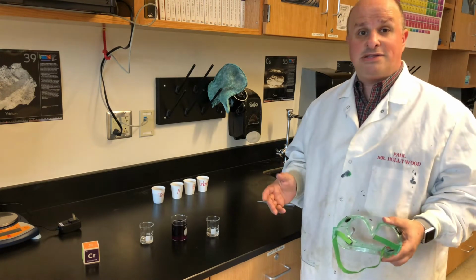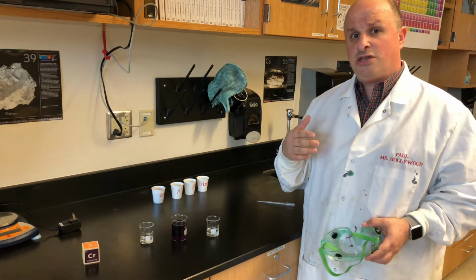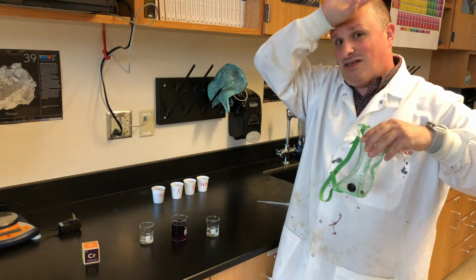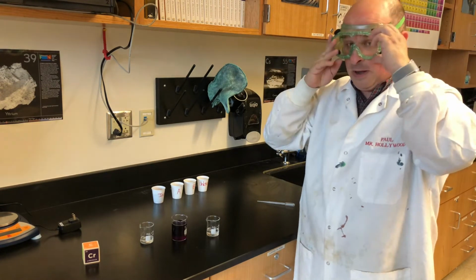So let's start by talking about safety. This lab does include some chemicals that can cause some irritation to your skin, so we're gonna wear lab aprons and we are gonna wear goggles again. I know how much you guys love those goggles. So I've got my goggles fitted on.